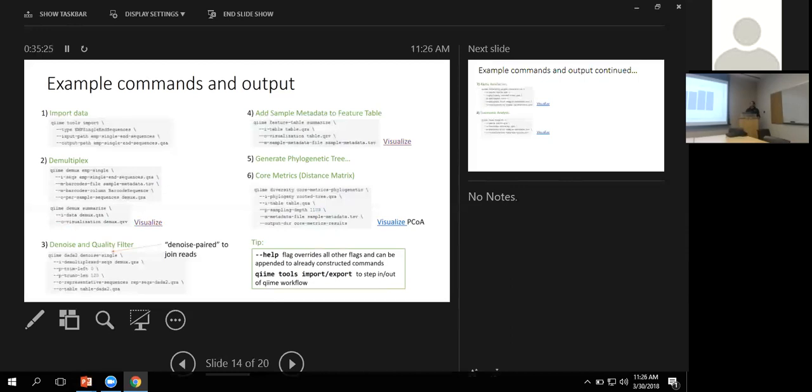So at 0, we're suggesting that there's no rarefaction, because everyone's familiar with rarefaction, right? At some point, we need to rarefy so we can do our diversity analysis. So this allows you to select different levels of rarefaction. And as you increase the sampling depth beyond the number of sequences that occur in any samples, they drop off, right? So we've lost one sample here. And as we go up, we can see that we're losing a lot of samples from the right palm.